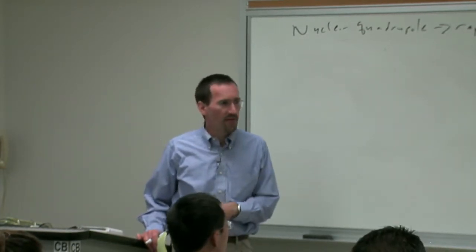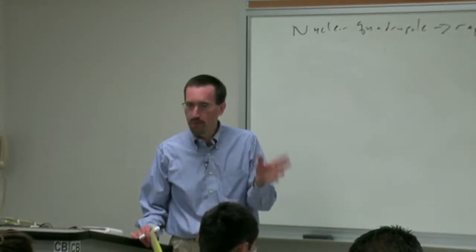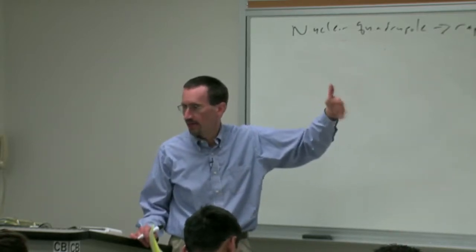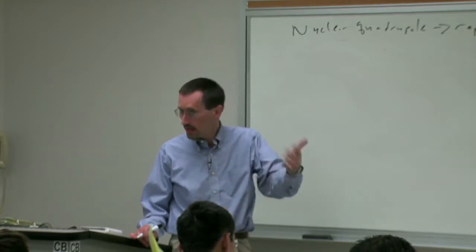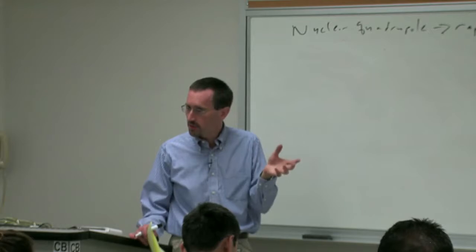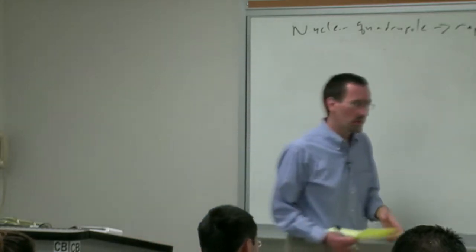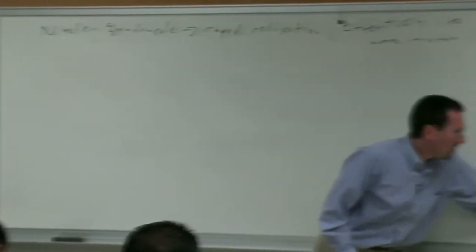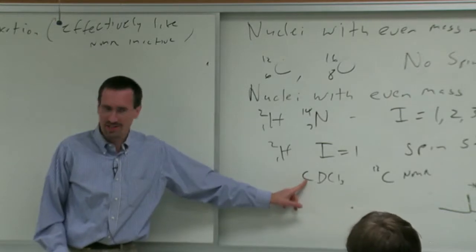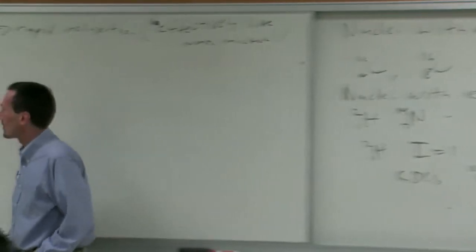that those have, well, all right, I will take that back. We can't know whether they have a nuclear dipole or a nuclear quadrupole, but we know they have a spin number of 1/2 or 3/2 or 5/2 or 7/2. They happen to have the higher ones. So we never see J coupling. We never see spin-spin coupling to chlorine 35 or chlorine 37. If we did, your carbon spectrum here, your C13 NMR spectrum, would actually be much more complicated because you'd be seeing splitting from the chlorines.